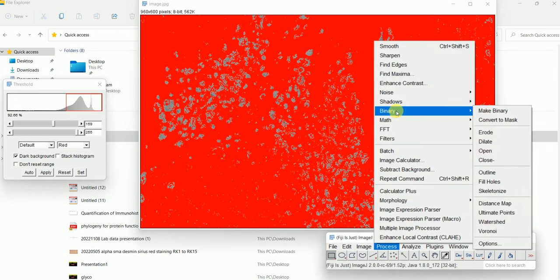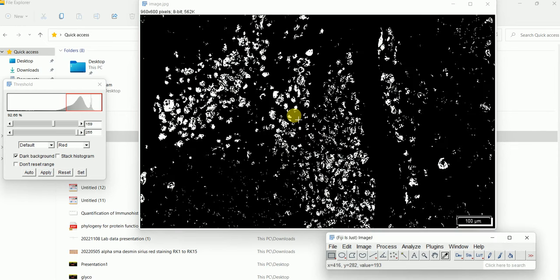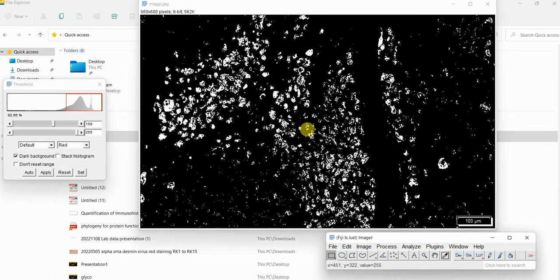Then go to Process, then Binary, then Make Binary. It will ask a few questions — just press OK. Now you can see that whatever the black part which was positive has now been converted into white bright particles.